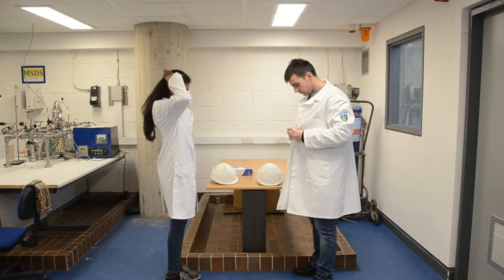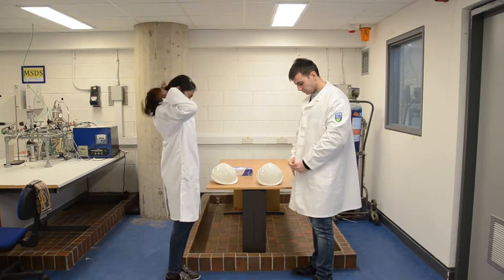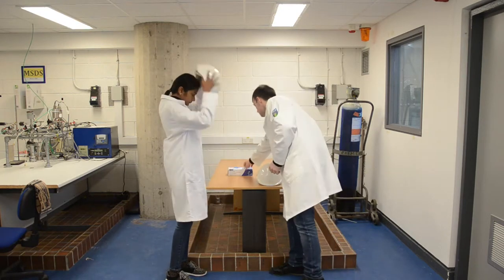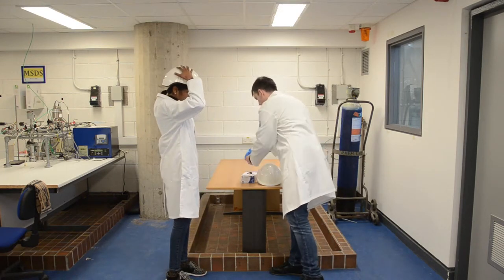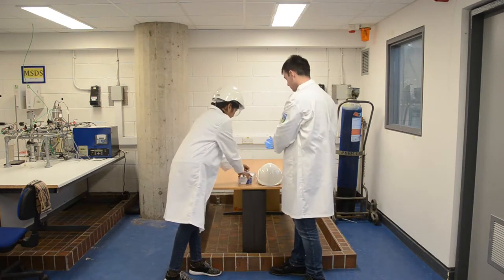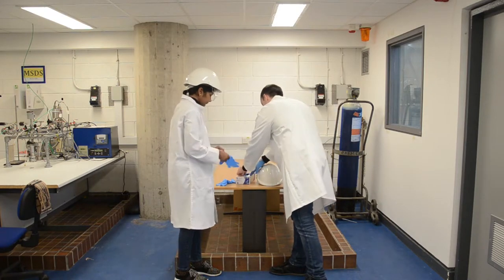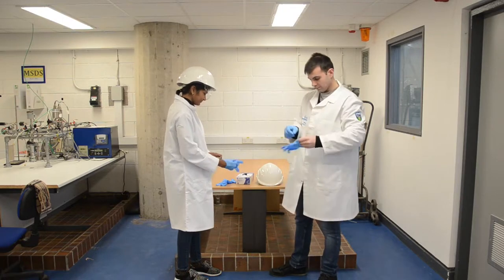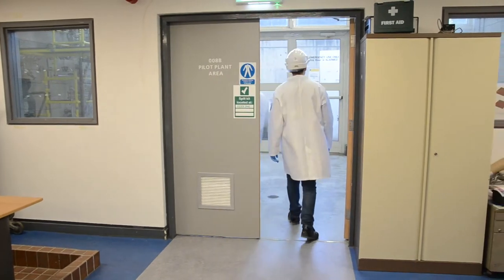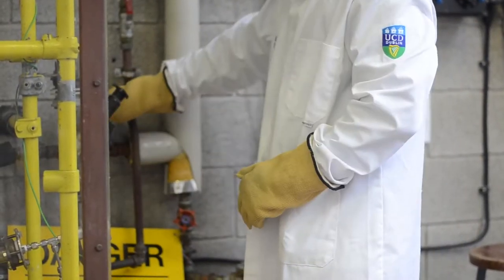At all times, appropriate PPE must be worn. Arrive to the laboratory appropriately dressed — no shorts, sandals or high heeled shoes are permitted, and long hair must be neatly tied back. Wear a white coat, closed and with the sleeves rolled down. Normally safety glasses are worn in laboratories, but for this experiment a helmet with a face shield is required, providing head and eye protection. Gloves must be worn to handle the chemicals. Insulated gloves are available and must be worn when handling valves on hot lines.